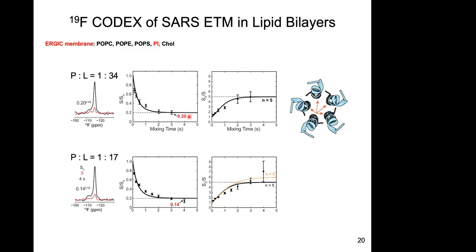In this case, we handled it by chemical synthesis of the peptide. So if you look at the fluorine spectrum, it's a very simple spectrum. It's literally one peak, right? And I can measure that in the S0 experiment, where again, this first mixing time is short, the second one is long. And I forgot to say, between the control and the dephased experiment, the sum of the two, Tm plus Tz, is the same. That's why I say you can factor out the T1 relaxation.